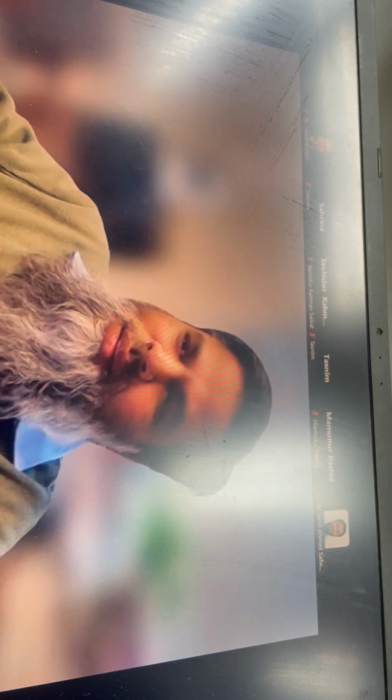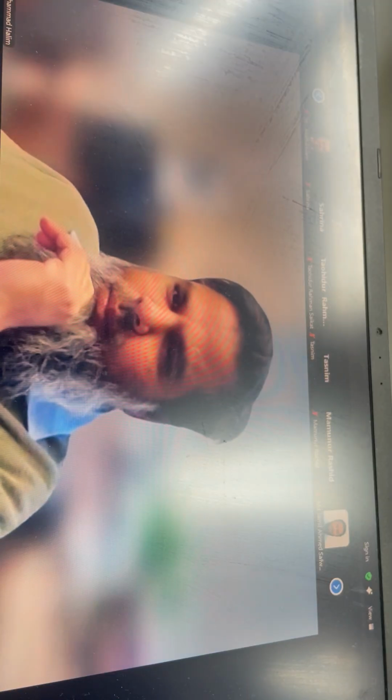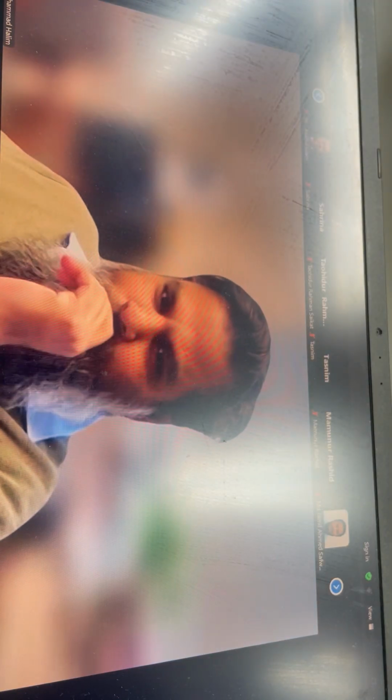That is called untargeted shopping. We call it untargeted lipidomics, untargeted metabolomics. There is a way to do those untargeted things. I will also discuss targeted and untargeted metabolomics.